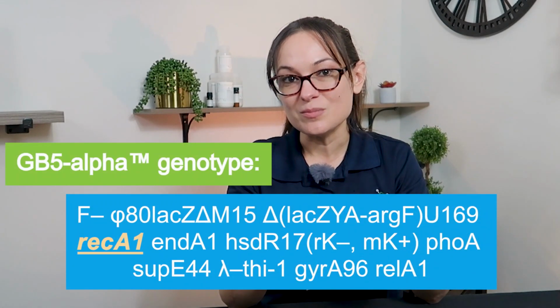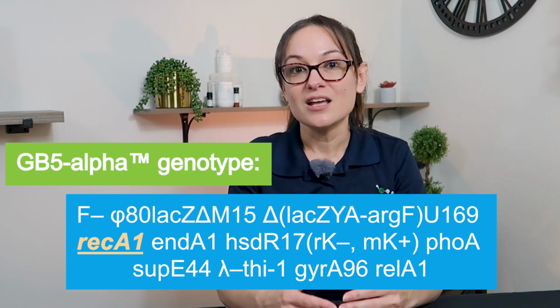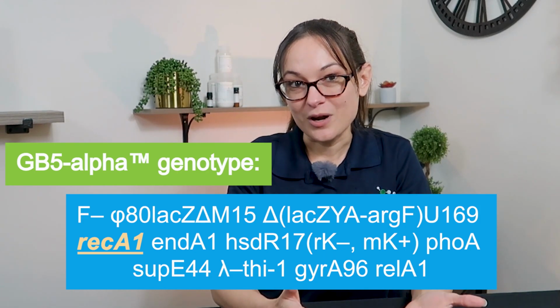Even without knowing everything about genotype nomenclature, you can see in these GB5 alpha cells that the genotype has a recA reference. The whole point though is that genotype shows you certain properties, and given the needs of your experiment, you'll want to look at the genotype to make sure your cell is equipped to do what you need it to do.